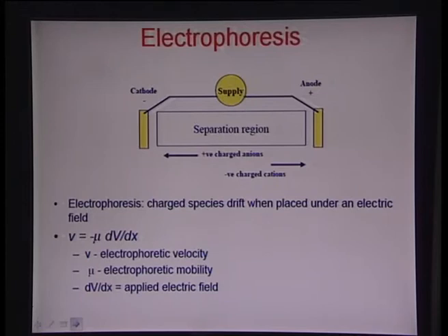So assuming that you have a bunch of different lengths that you want to separate, and you jumble them all together in a solution and use an electric field to inject this through the series of pores or sieves in the gel, it is almost always true that the shorter the strand is, the lesser is the frictional effect, and it starts moving faster in comparison to the longer lengths of DNA. So there is always a fractionation effect, with the longer ones moving slower and the shorter ones moving faster, and after a while you can see these independently.